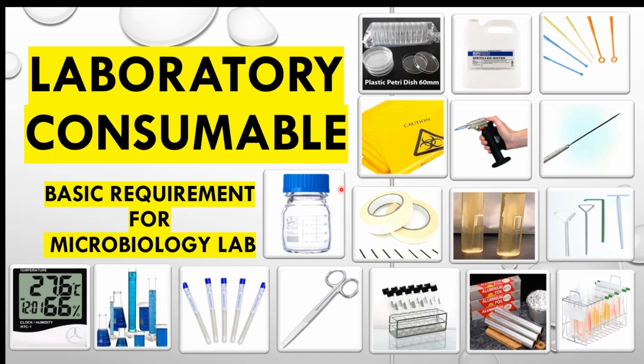Today our topic is laboratory consumables, especially when we are working in a microbiology laboratory: which items, which consumables we require for our testing. This is the summarized view of the different items we need for our laboratory functions. Hopefully it will be helpful for you when you watch this video.